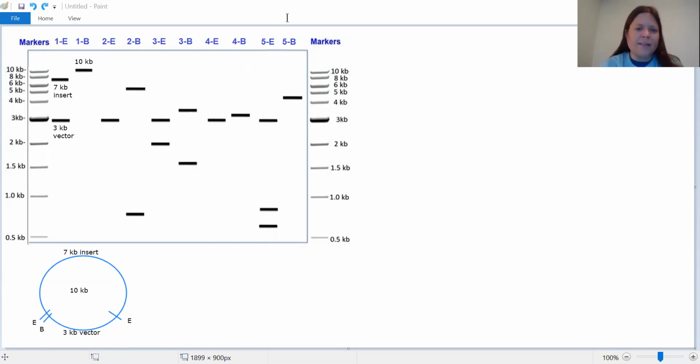Now all that's left is to add our T3 and T7 sites. We know that those are also in the vector, very close to the enzyme recognition sites. The reason that these lines are all different lengths is because I'm new at using this annotate tool, not because they ought to be.